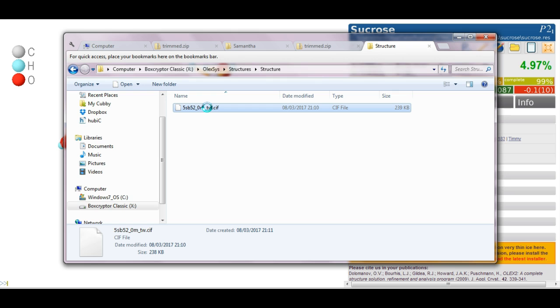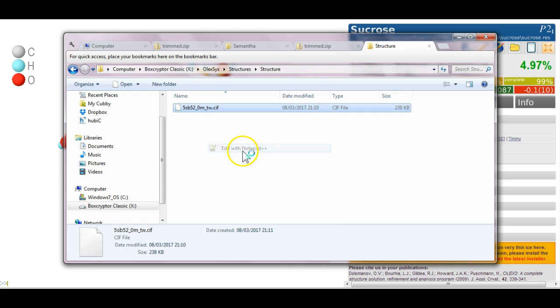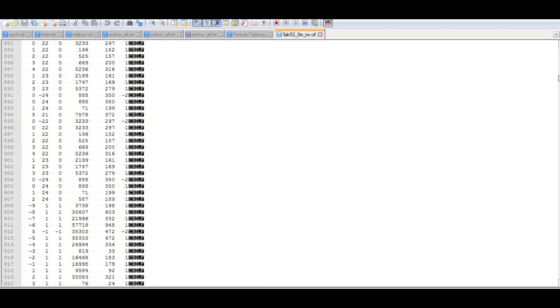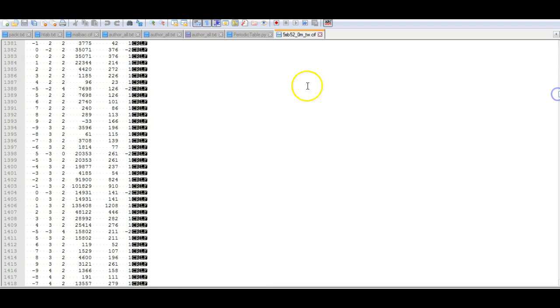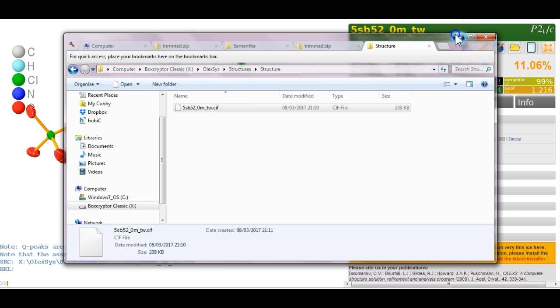In other words, the HKL data is in there. If I open this with notepad++ then you can see there's your normal CIF stuff, but also down here is a whole lot of reflections, so the HKL file is embedded. In Olex2, what do you do? You just drag the CIF file into Olex2 and that opens this combined CIF file.